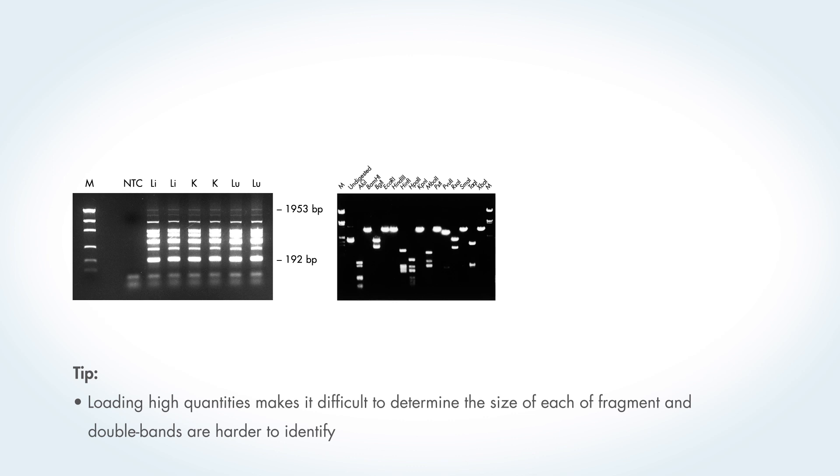Clearly the bands in the marker lane, labelled M, are higher up in the gel than the bands in the sample lanes. So they're not a lot of use when estimating the size of the sample bands. Moreover, there are only a few bands in the marker lane. A good marker should have more bands than this to cover a range of sizes.